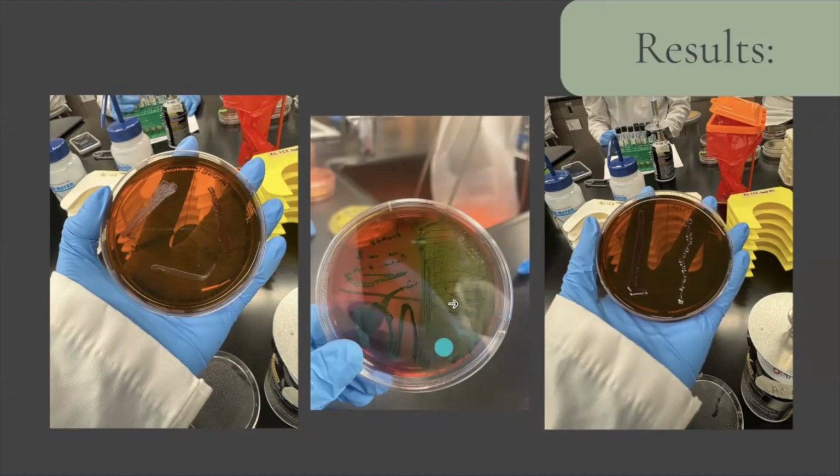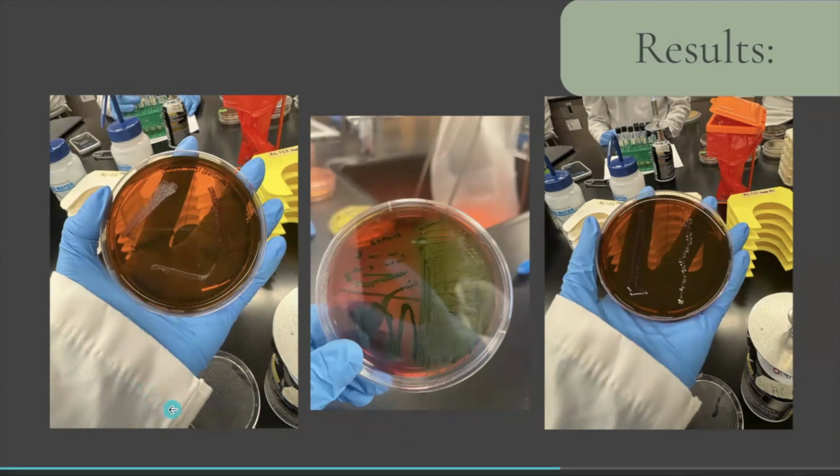On this picture next to this should have been what the E. coli should have looked like. But our K. pneumoniae growth was kind of purplish, and that could mean it's a lactose fermenter, if the EMB also didn't affect the outcome of these other two.